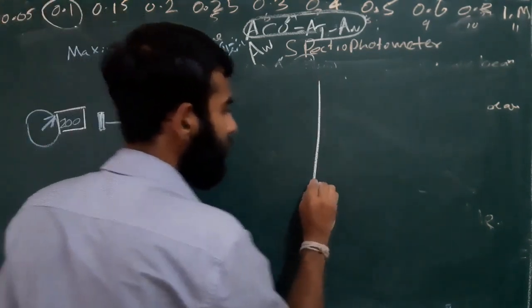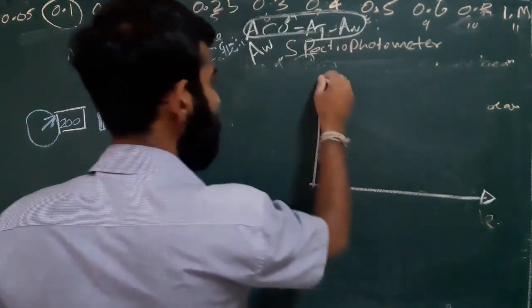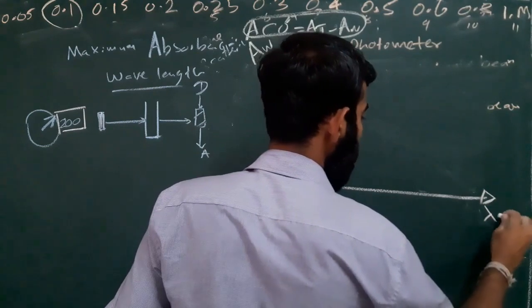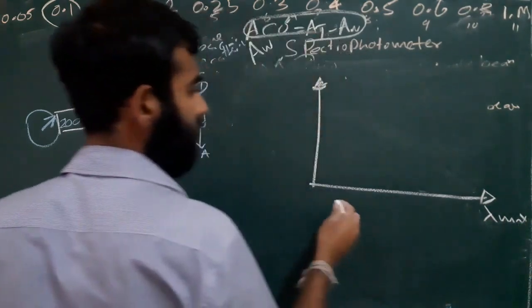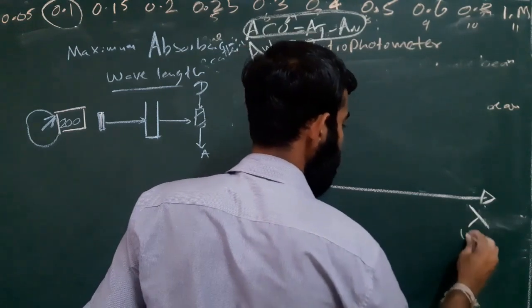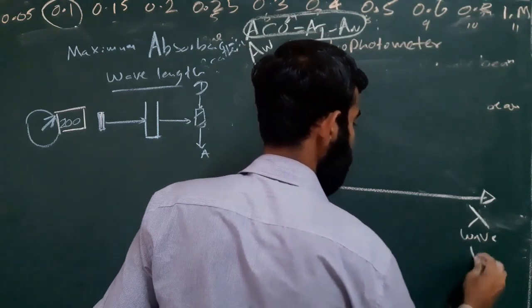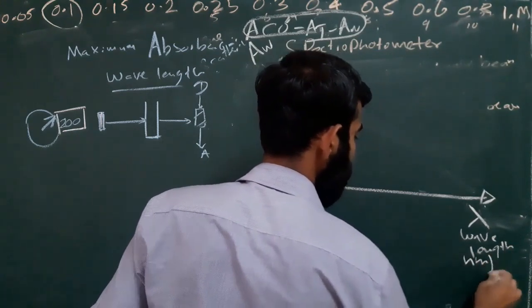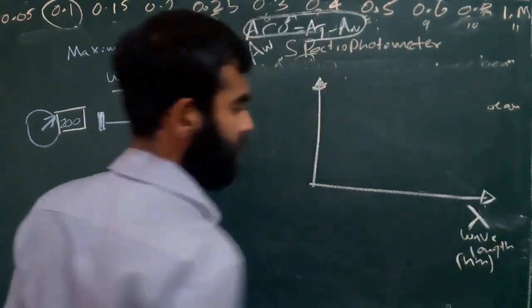I will plot a graph with respect to lambda max. Here lambda or wavelength in nanometers, lambda.